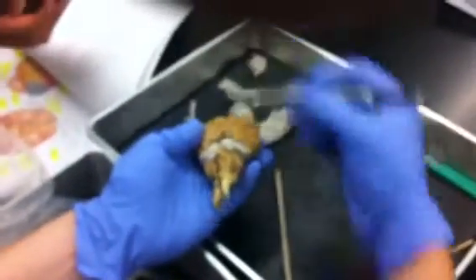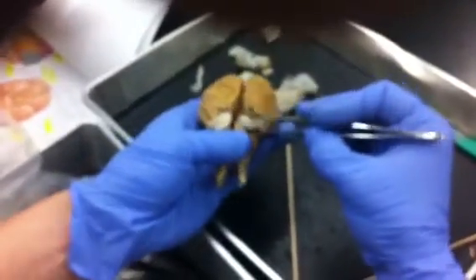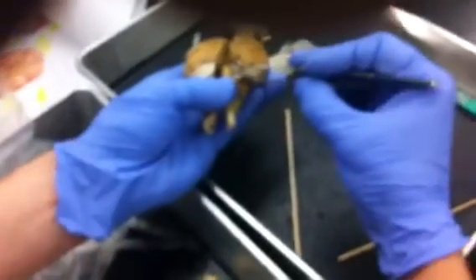Oops, I just put a gouge in there. Sorry. It looks like it has a big space. Yeah, and we'll talk about the dural folds that come in there, and blood vessels are in between these dura layers in there. Big blood vessels are inside of there, big veins.